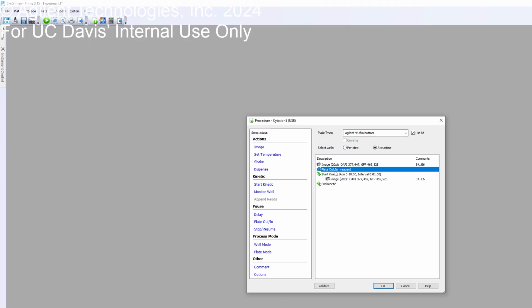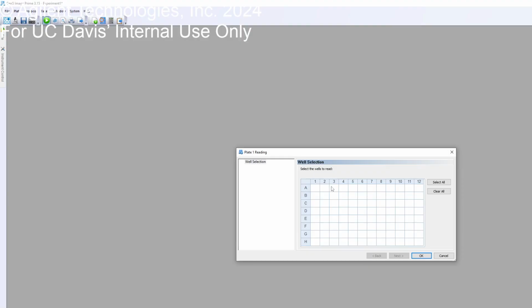And just email me once you get time, so I can share some app notes with you and discuss everything about that. So I'm going to again just delete the rest of the information for now. Any other questions before we start up a very brief run? No? Okay. So I'm going to click OK, and then we'll just start this experiment. And let's just select maybe this A12 for now, and click OK.